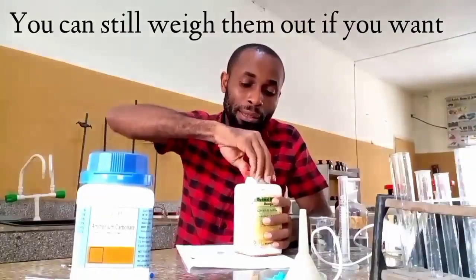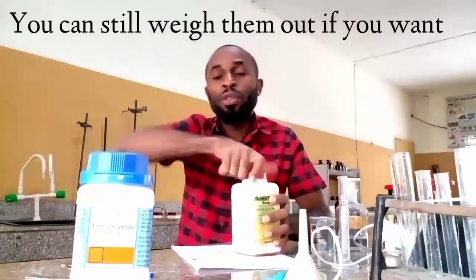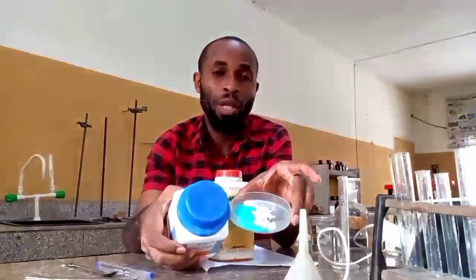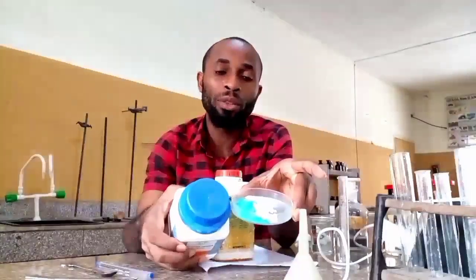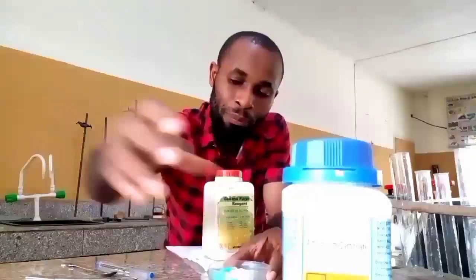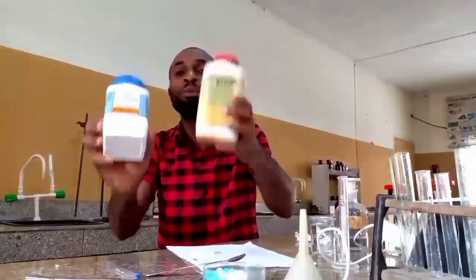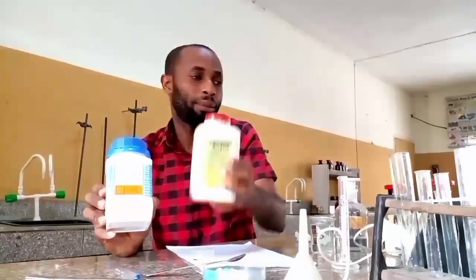If you look at this, the color of this salt is blue, even though not the royal blue compared with this. Hope you got that. Now I am going to mix these two salts together. Mixing them together, I am no longer making use of this. I need to remove this from the screen.